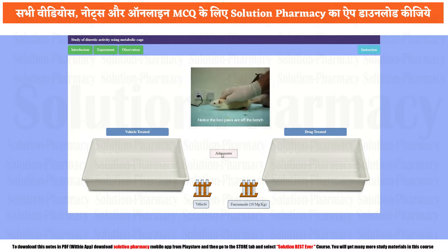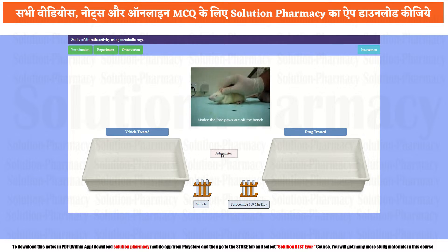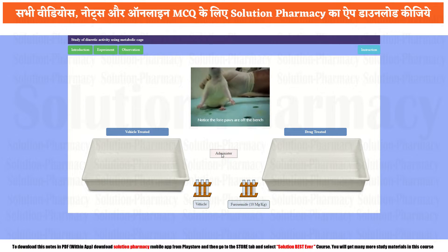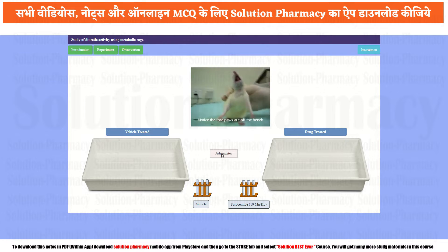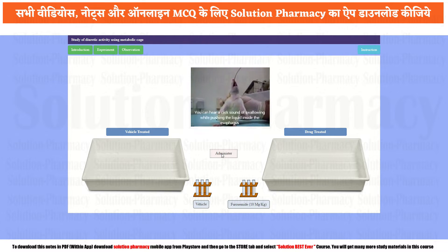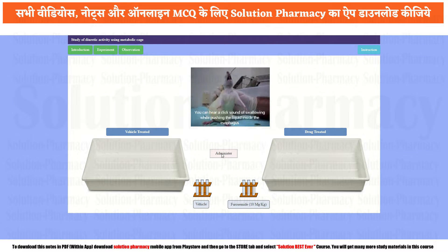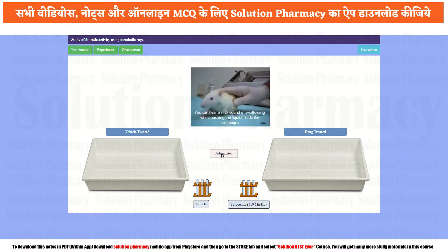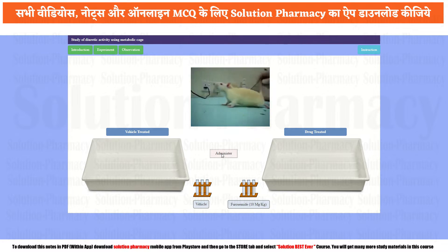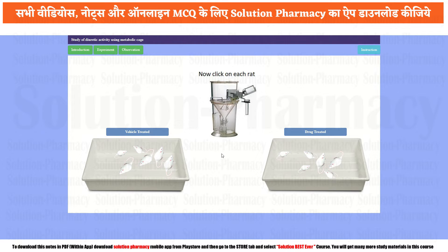The animals are separated into two groups. The first one is vehicle treated and the second is drug treated. Vehicle treated groups are those which receive only the vehicle — that means the solvent used to dissolve the drug. Drug treated groups are those which receive the drug to be tested. According to this procedure, the experimental animals are divided into these two groups.